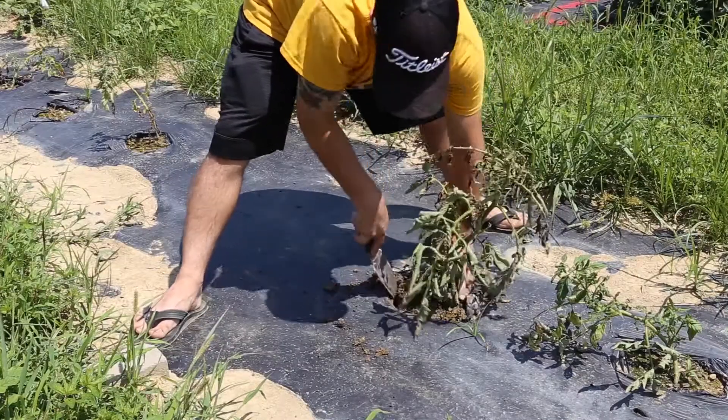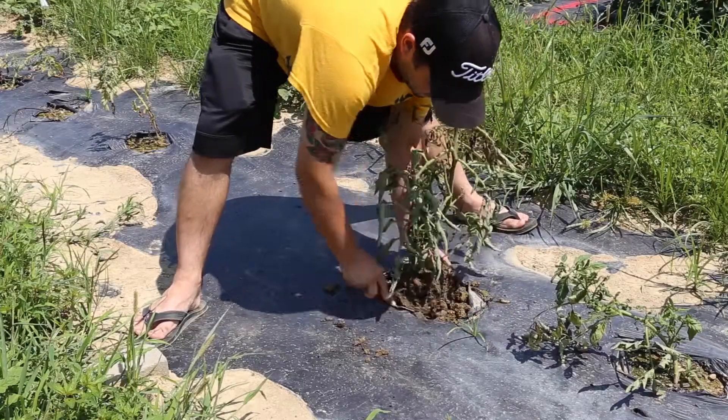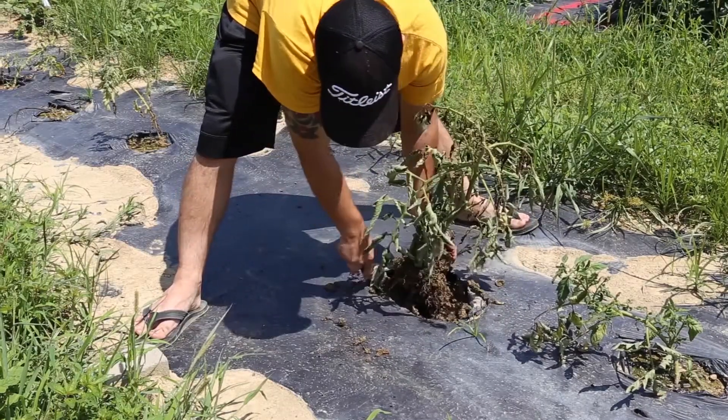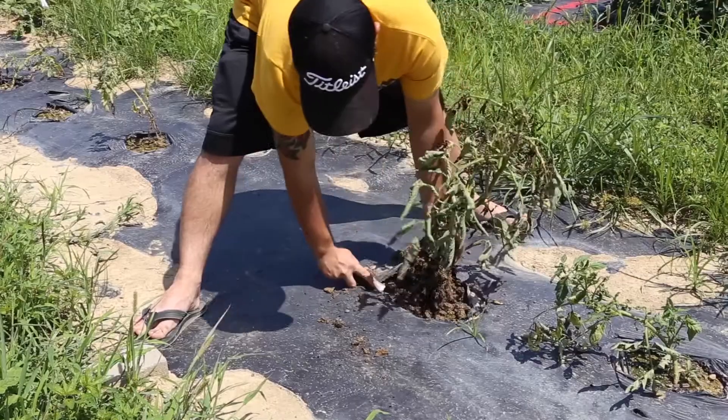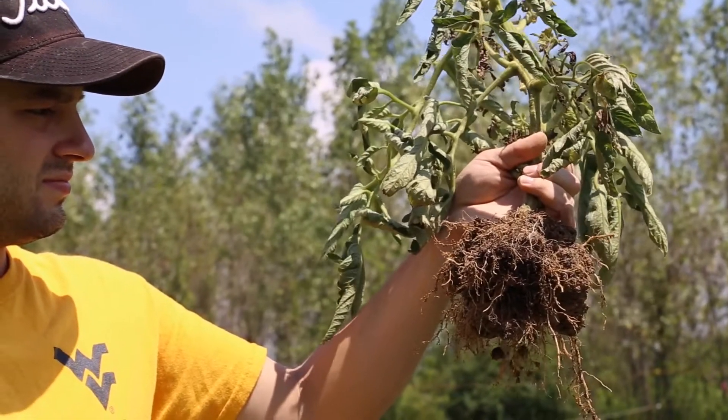Never pull plants from the ground. Instead, dig them up. Get a good section of the root system as well as the soil connected to it. If a plant is showing a systemic decline, the problem likely originates from the roots. Thus, a root sample is a must.